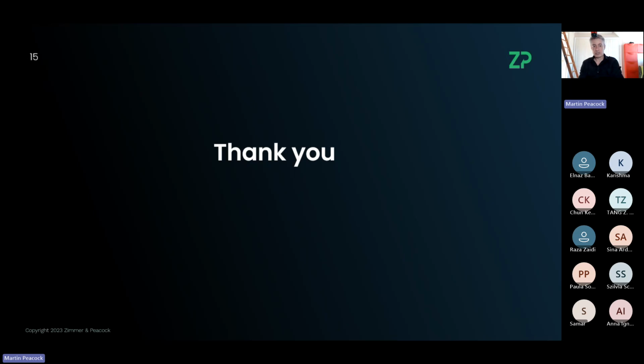I know that's low, but lots of screen-printed electrodes on the market, including Zimmer Peacock, are not super resistant to organic solvents. So it's not a great technology for organic solvents. I do recognize those solvents, acetonitrile and DMSO, dimethyl sulfoxide. They're pretty aggressive. I suspect you'll destroy those electrodes in some seconds. So I'm sorry to be disappointing on that.